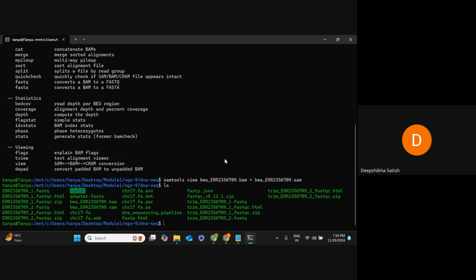So did you get the SAM file in your system? So this is the output. You can see it is in the SAM format. So tell me, can we move ahead if you have this SAM file in your system? Just let me know. Is it generated? No, ma'am, not yet.